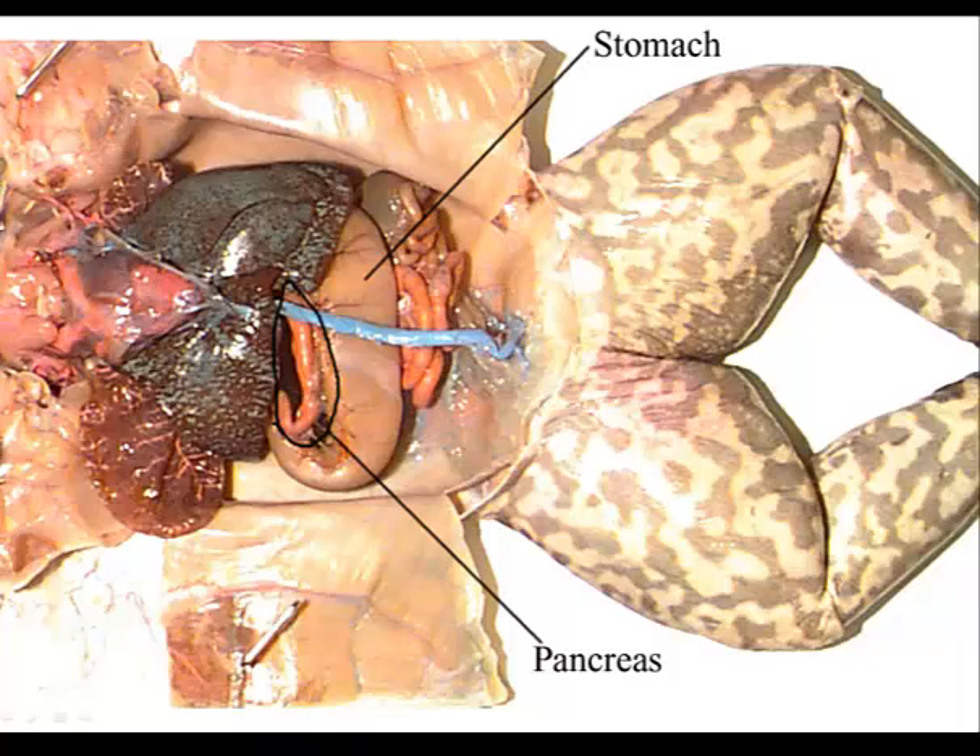We'll want to examine the esophagus by going into it through the mouth. We're going to cut into the stomach so we can see the rugae, and once you've cut into the stomach, you may find some partially digested food.